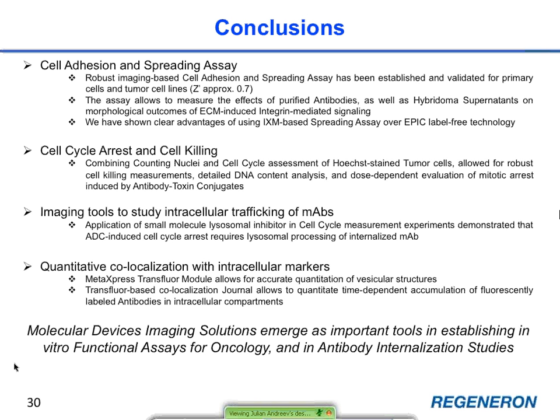The assay allows us to measure the effects of purified antibodies as well as hybridoma supernatants on morphological outcomes of ECM-induced integrin-mediated signaling. We have shown clear advantages of the IXM-based spreading assay over label-free technology. For our in-house ADC program, we combine a cell-killing assay, detailed DNA content analysis, and dose-dependent evaluation of mitotic arrest induced by antibody toxin conjugate.